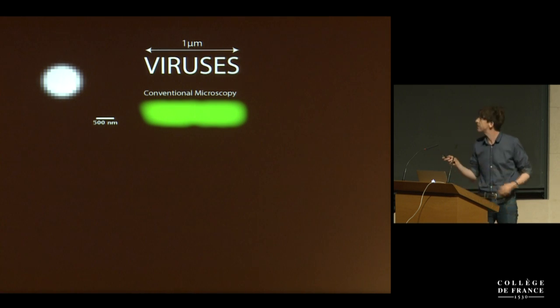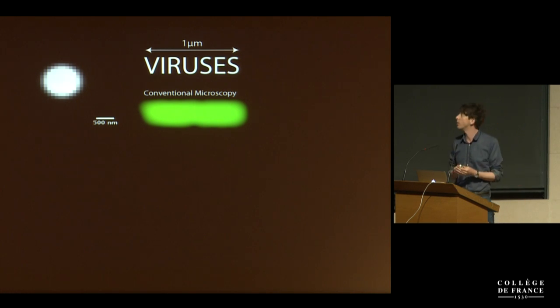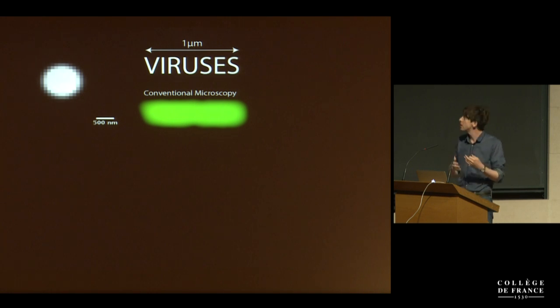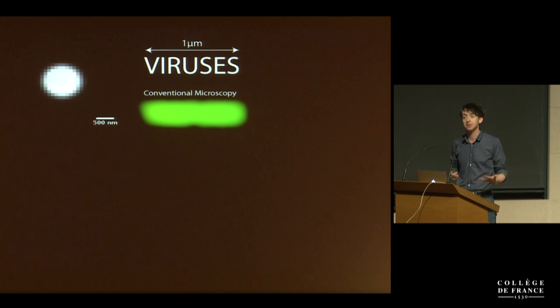Now I can illustrate this further by an example of a nanoscale word that's decorated with fluorophores. If we view this by conventional microscopy, due to this so-called diffraction limit, we have no chance of reading the word. However, super-resolution microscopy allows us to break through this diffraction limit. And I am largely using a technique called localization microscopy, which was principally developed by our keynote speaker, Eric Betzig.